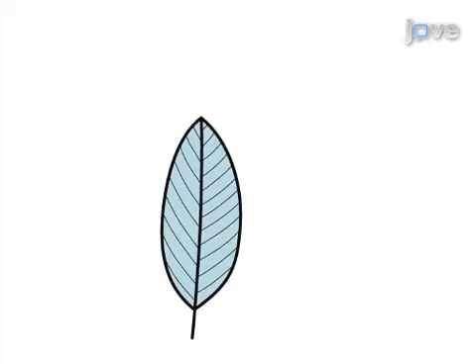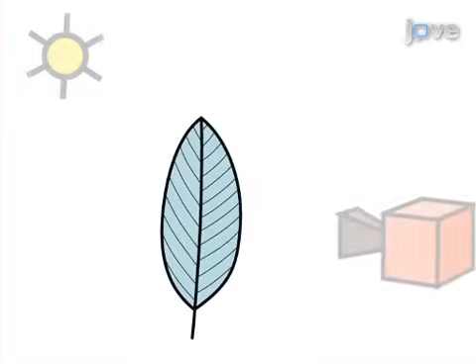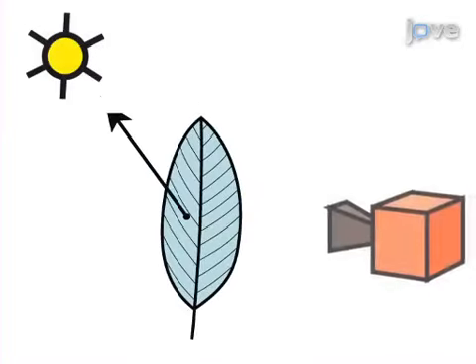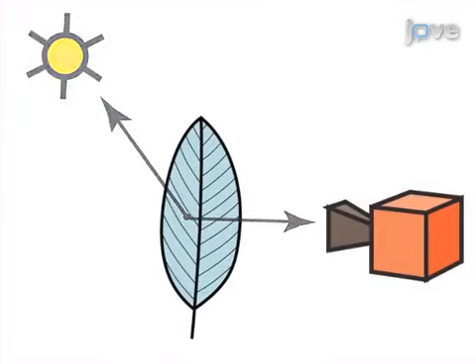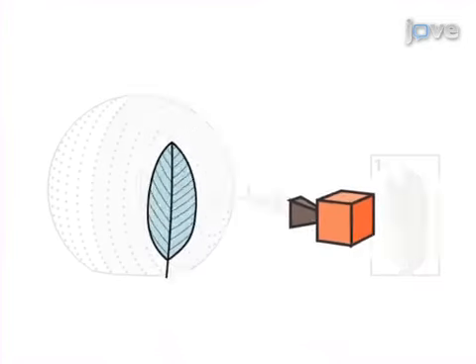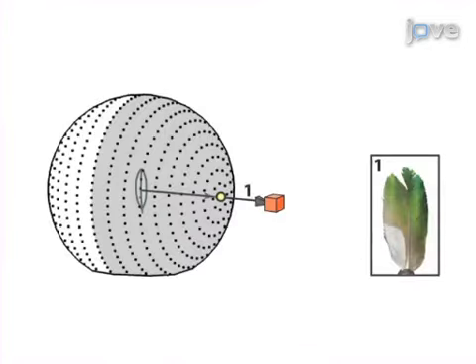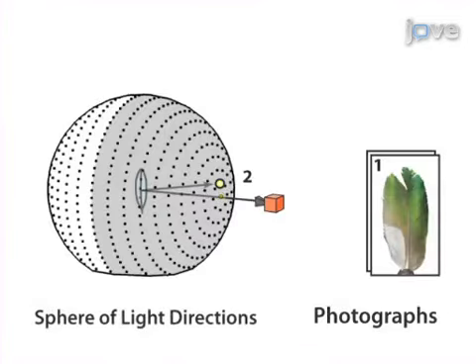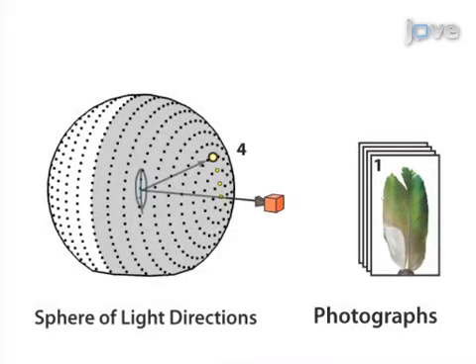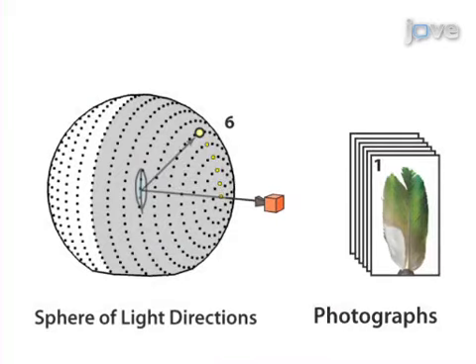To control incident light and view directions, place a material at the center of the spherical gantry with its lamp mounted on one arm and its camera mounted on another arm. Sequentially photograph the material while systematically moving the lamp through a series of discrete positions on a sphere centered on the material.